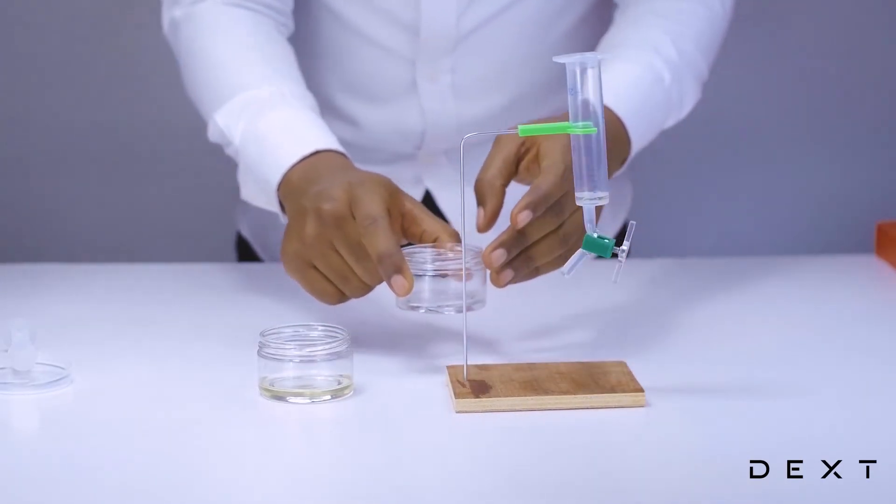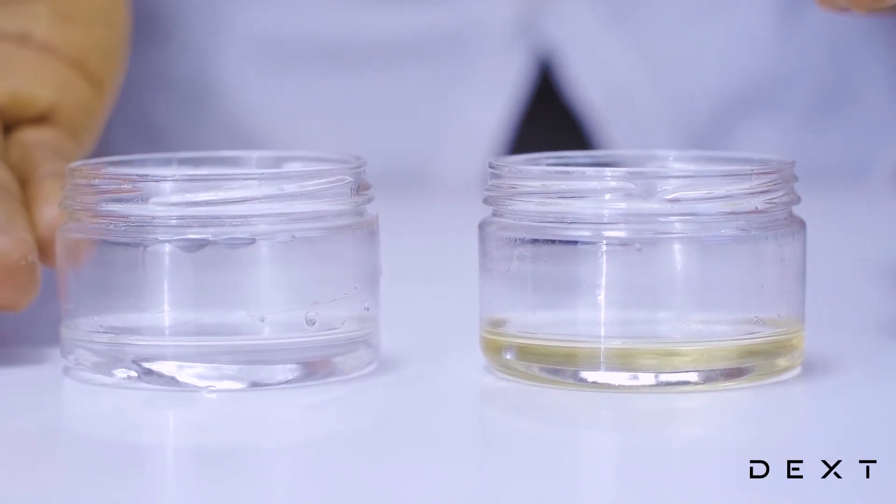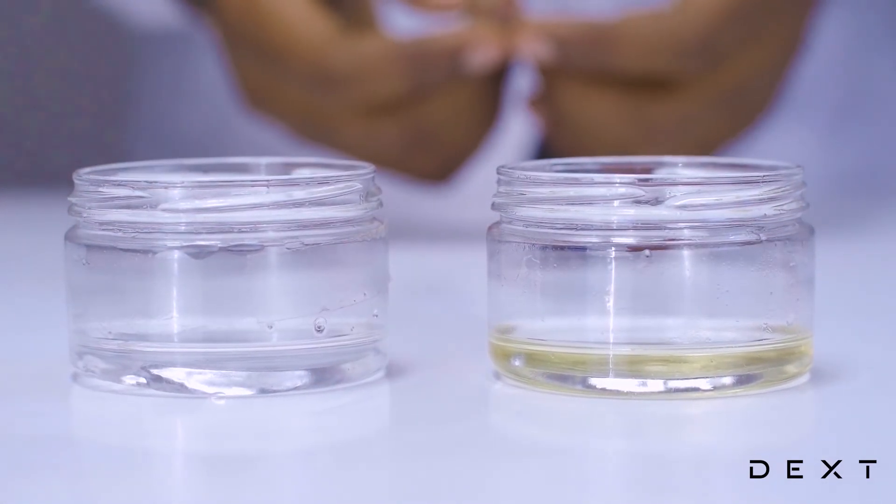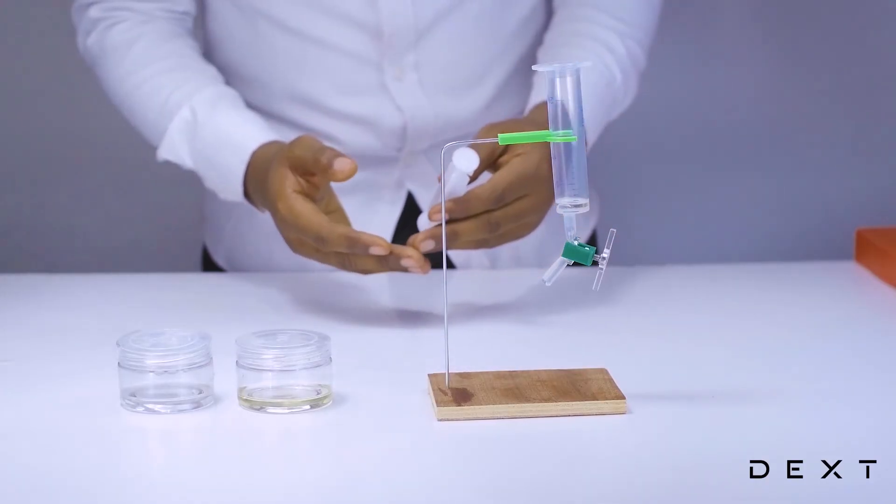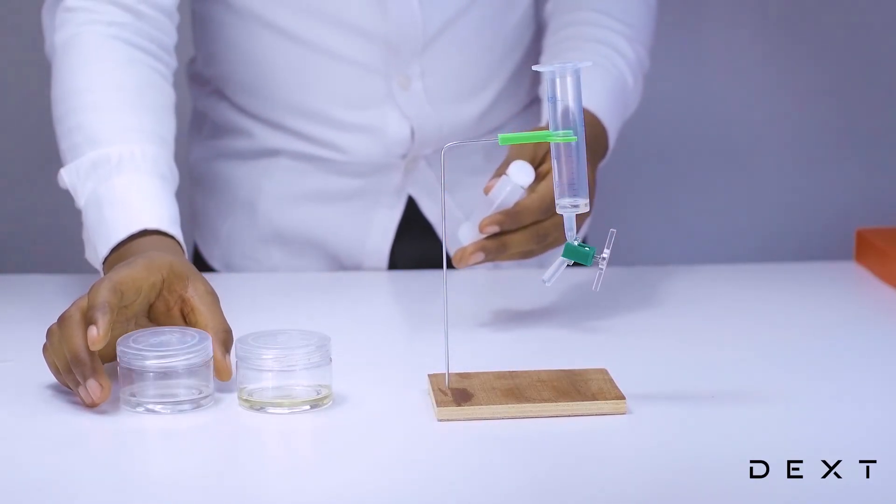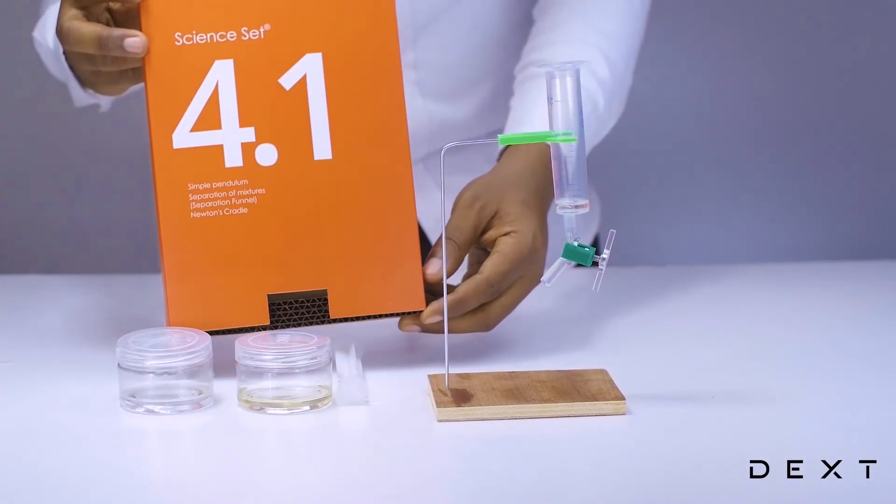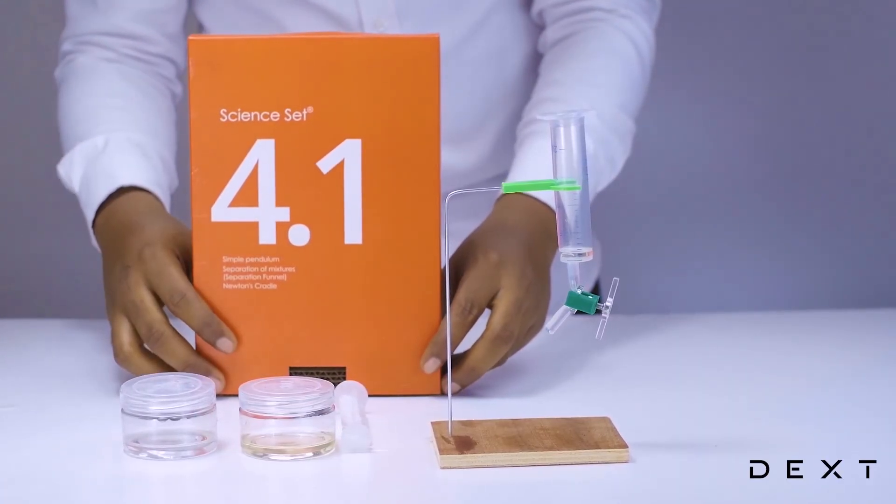Nice. Now, we have separated the two immiscible liquids, our water and our oil. They were first mixed together, but using our separating funnel, we have been able to nicely separate them back into the components. As always, this has been the tutorial using the Dext Science Set 4.1.